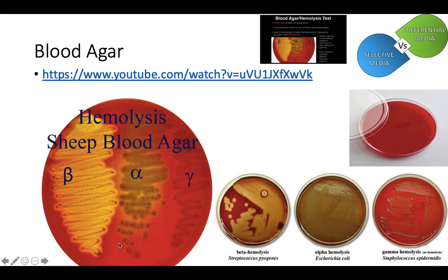These particular species of bacteria produce a very strong hemolytic enzyme. That very strong hemolytic enzyme is going to be released outside of their cells. It's an exoenzyme. That exoenzyme will come in contact with the red blood cells inside of the agar and break them apart, shred them to pieces, essentially just blow them up. And when they're blown up, the red color from the hemoglobin is going to be destroyed as well. The hemoglobin will be broken apart, and all of the iron will be stripped out of the hemoglobin molecules for use by the bacteria. So once the hemoglobin molecule is gone, that's what makes blood red, by the way, the red color of the blood cell is gone.